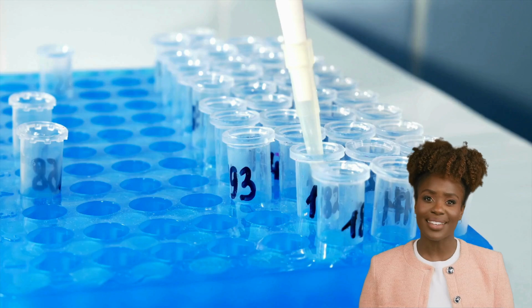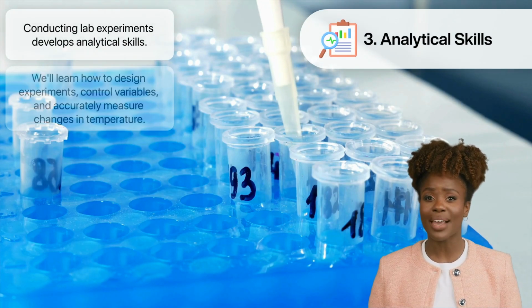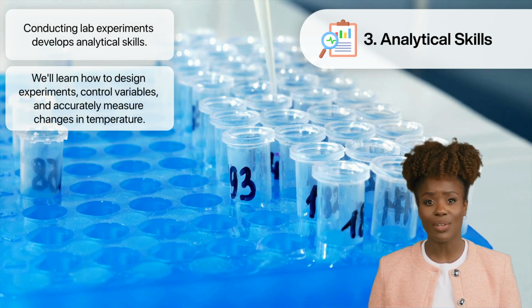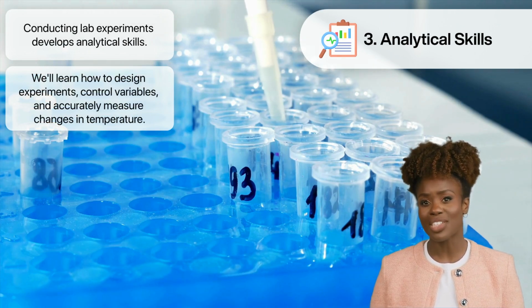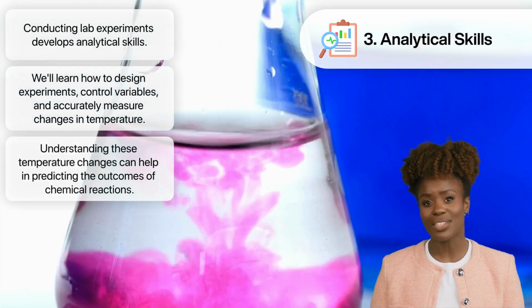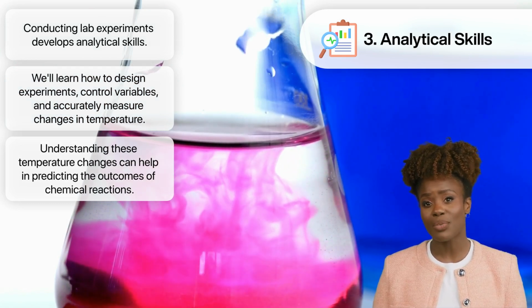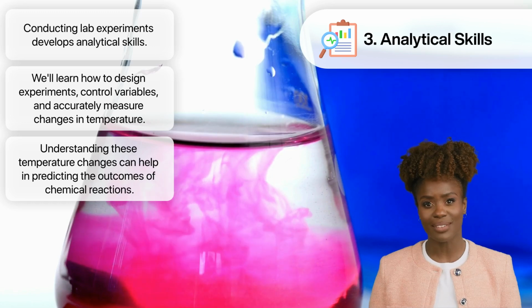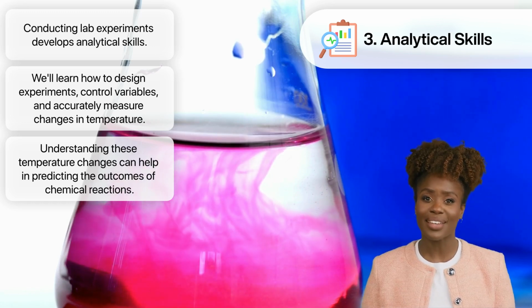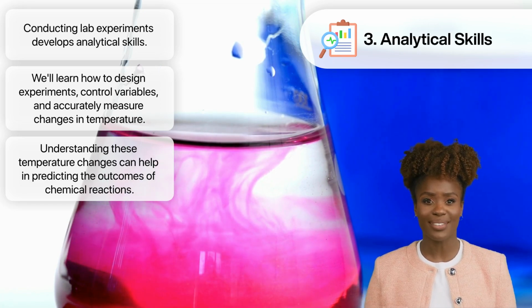And finally, conducting these experiments will sharpen your analytical skills. You'll learn how to design experiments, control variables, and accurately measure changes in temperature. Plus, understanding these temperature changes can help in predicting the outcomes of chemical reactions, giving you a deeper understanding of reaction dynamics. So, let's get started and uncover the fascinating energy changes that chemistry has to offer.